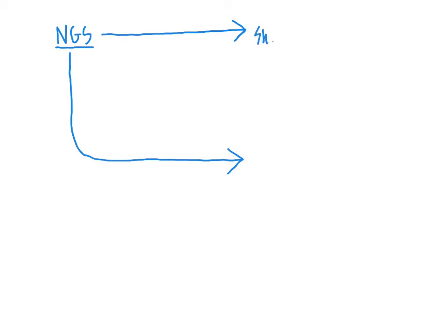Now, when we consider next-generation sequencing, which is going to be our main focus here when we think about sequencing techniques, because it is the next-generation sequencing that has very much enabled our study of genomics, we can break the field into two different types of overall sequencing. One is referred to as short-read sequencing, which focuses on next-generation sequencing techniques that provide nucleotide sequences that are between about 35 and 700 nucleotides in length.